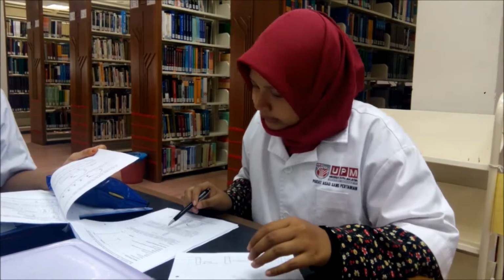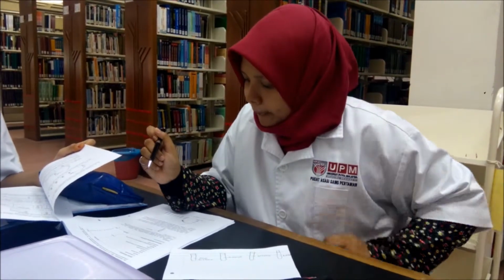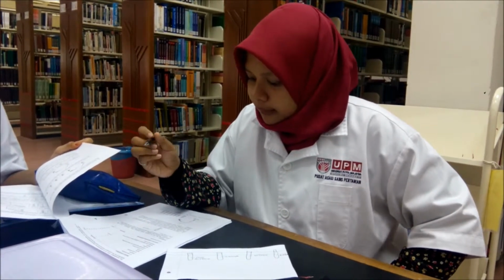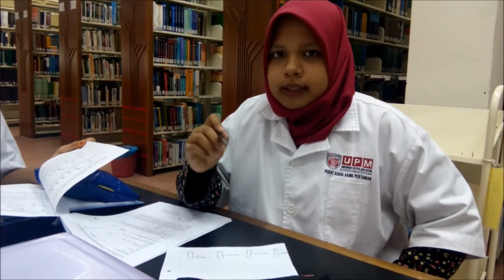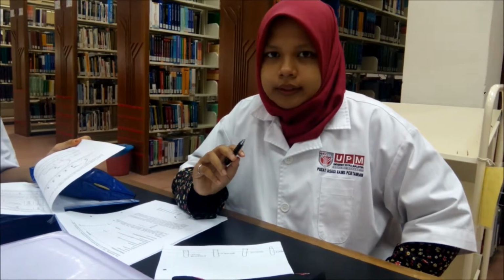And then the remaining 2 cuvettes are labeled start and end. The upper part of the cuvette will serve as control time points at the start and end of the reaction, and neither cuvette will contain enzyme. So E1 to E5 will contain enzyme, but the start and end will not contain enzyme.